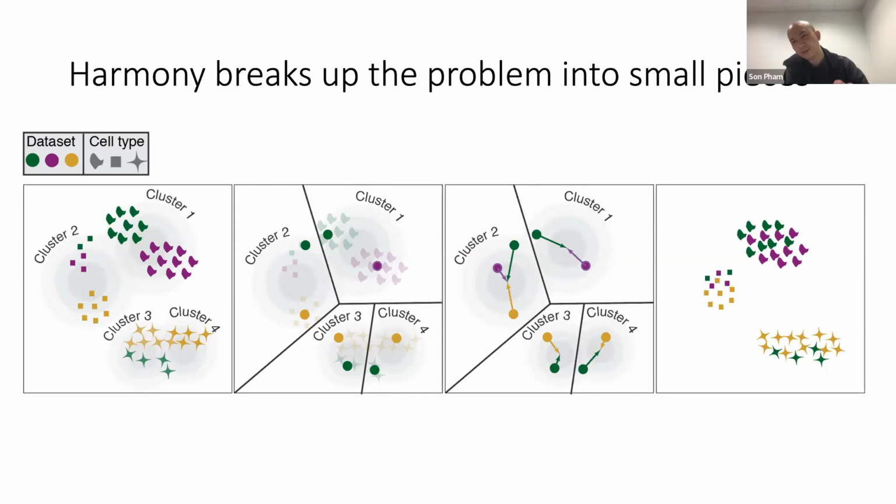Yes. Another related question from myself: after batch effect removal, what are the transformed values useful for, except visualizations and grouping cell types together? Yeah, so once we've corrected the PCs, visualization, as you've mentioned, UMAP and TSNE, and grouping cell types together, clustering, is done on the harmonized PCs. You can do trajectories with popular algorithms. So Slingshot, DDRTree, they can all work on PCs, right? Because they just need a KNN graph as input, basically.